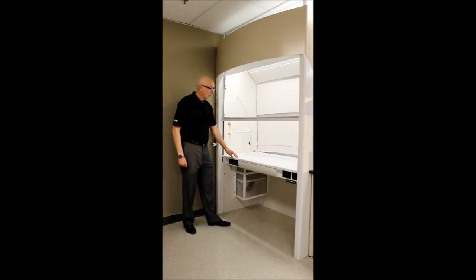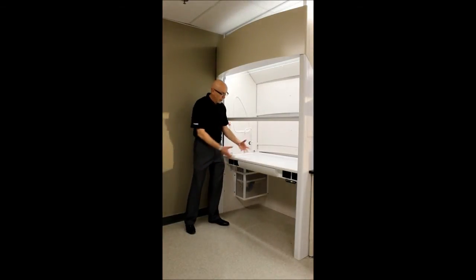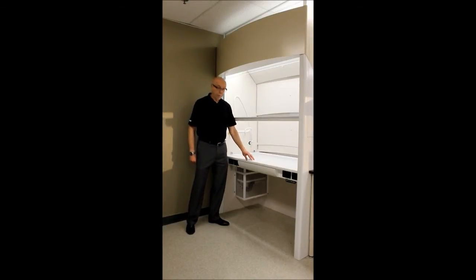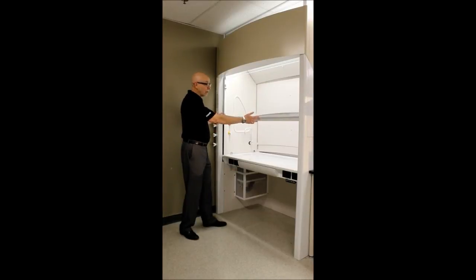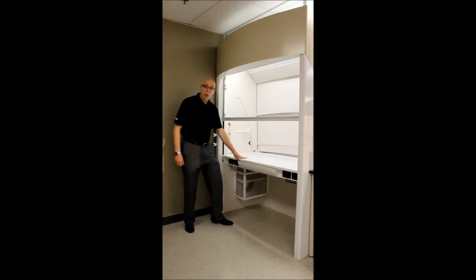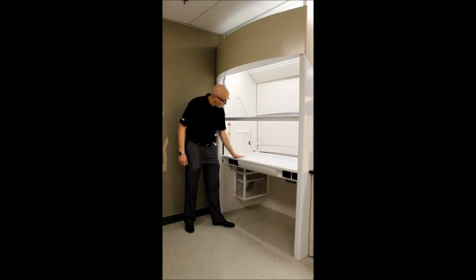It is a fume hood that is very friendly for people putting heavy things in and out of the unit, or most specifically for ADA. You'll notice there is a lot of glass — it's very bright, very open, and very aerodynamic from the sash handle down to the horizontal airfoil, which is a flush sill.